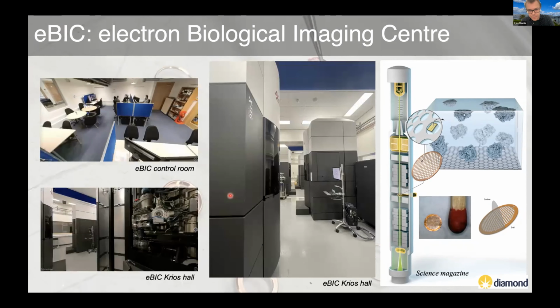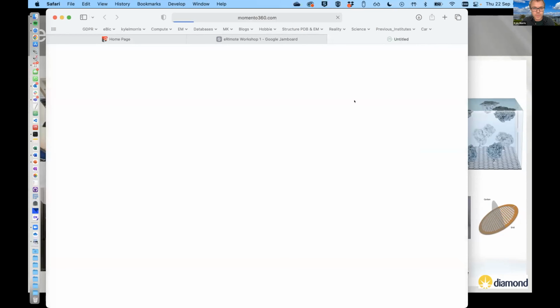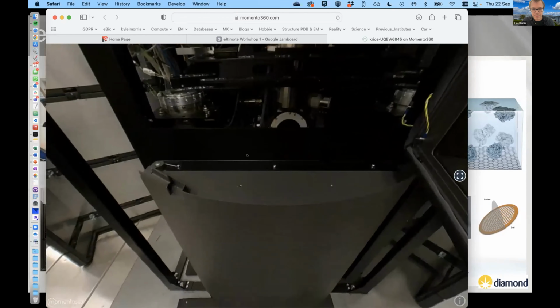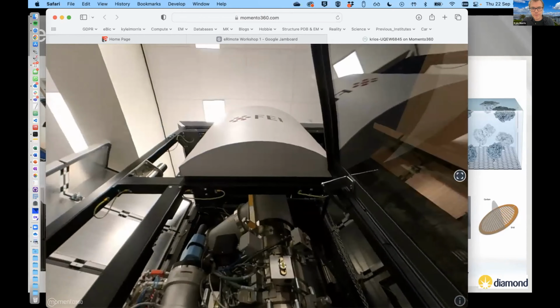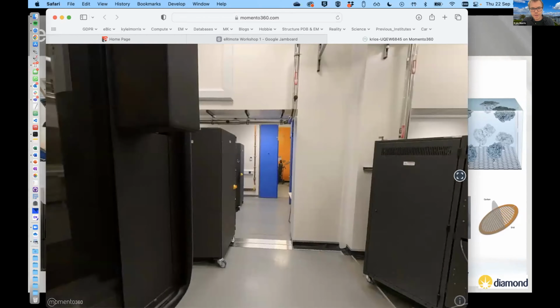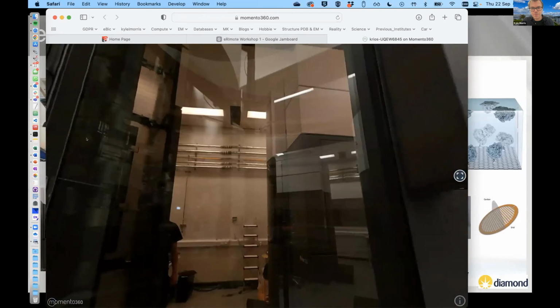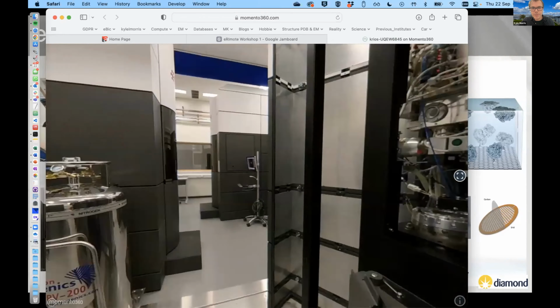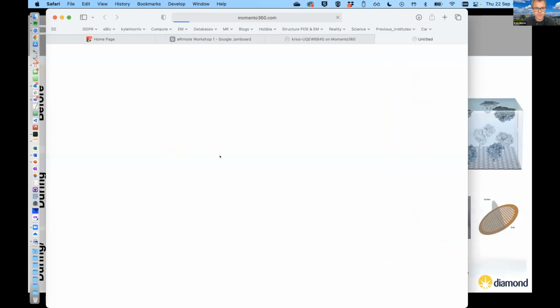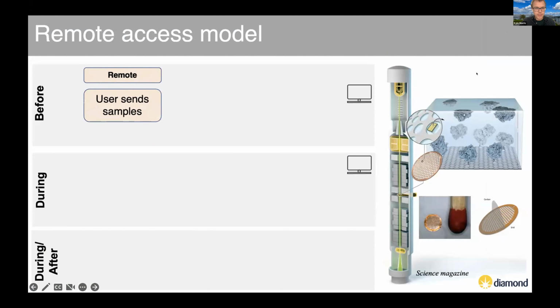This is how they look, and I just bring this up quickly so you can see this whizzy 3-dimensional image. This is to scale. This is kind of how it looks when you're standing in front of one. And there's our Krios, with 4 of them sitting next to one another. When we did this, they weren't even sure that you could put them next to each other that close, but it turns out it works quite well.